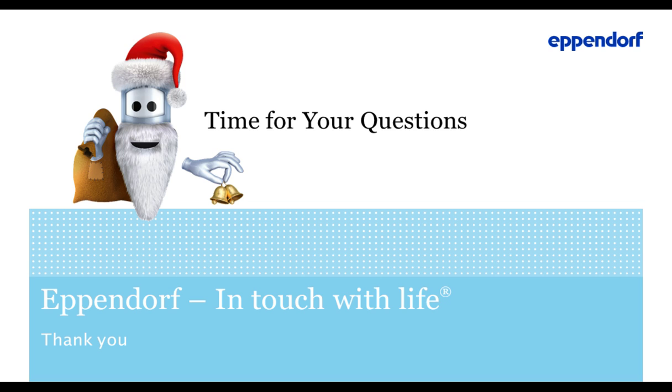Right, Ines, thank you very much. I have another interesting question I've already heard a couple of times during this webinar, and this one probably goes to David. And the question is, which impeller is suitable for stem cells?